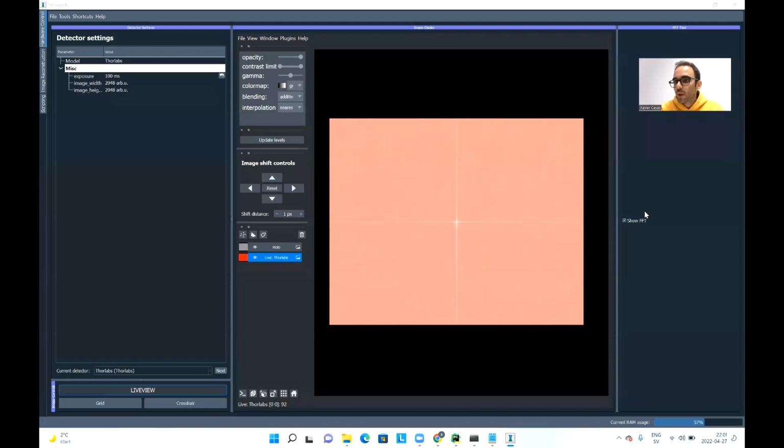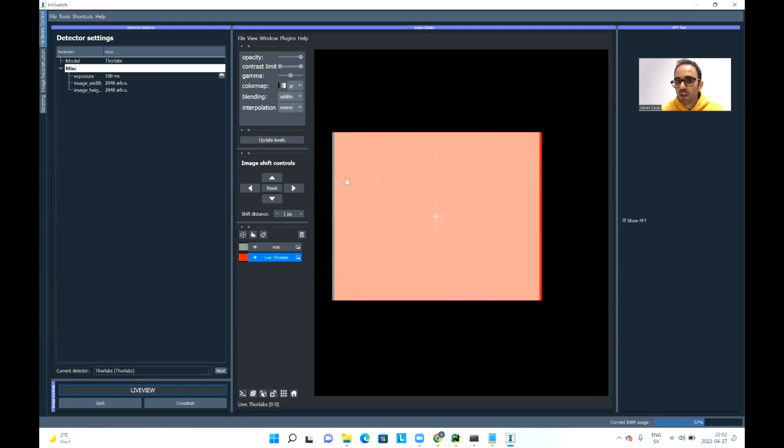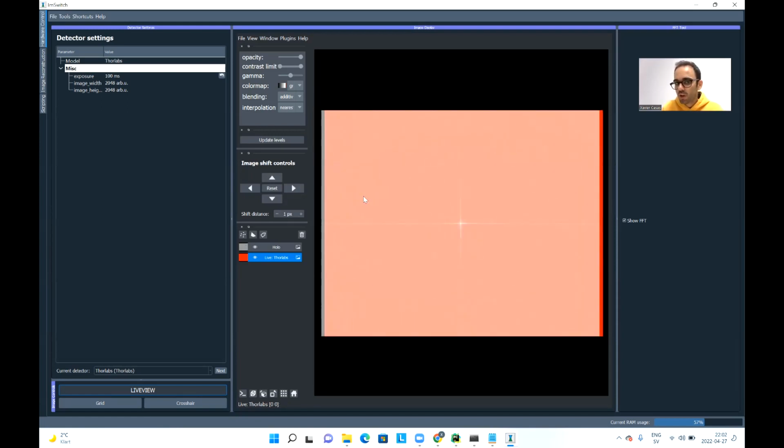And I also wanted to quickly go through other ways of connecting or interconnecting Napari and ImSwitch. One is, for example, this type of widgets that we can add in the viewer. And for example, this one we find very useful to align each channel to another. So whenever we click, one image is moved with respect to the other. This is very useful when we are doing multicolor imaging, because usually the channels are not aligned because of aberrations, and also because of the natural path of light where they go through. How is this done?